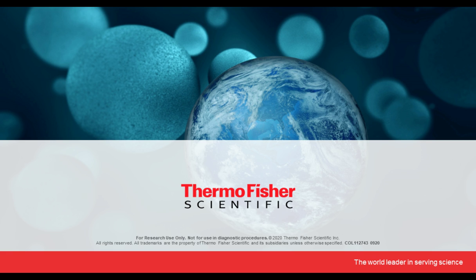But the probability of that happening is pretty low if you just follow the steps of the protocol and include the wash steps before and after labeling with no stain. These are 2-minute washes with water really. It's a convenient way to process, but it's important that the steps are followed so we don't have any background issues and there is no variability to the actual signal coming from labeling of proteins with no stain.